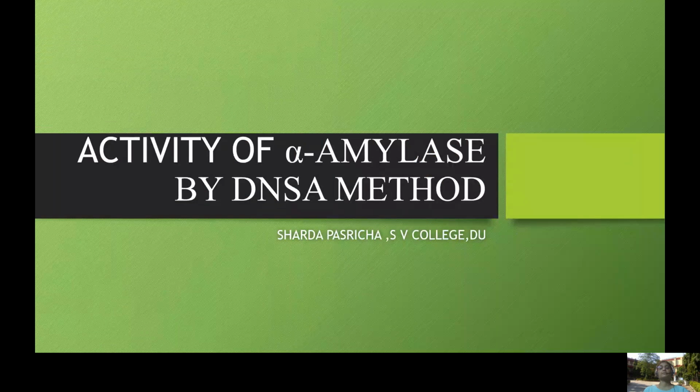Hello students, today we are going to see how to determine the activity of salivary amylase using the DNSA method. So this is the experiment that we are going to do today, the activity of salivary amylase or alpha amylase using the DNSA method.